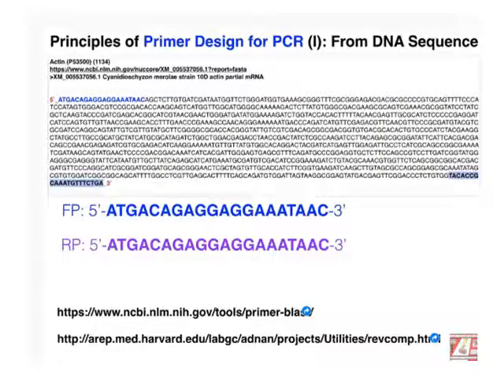Here we are going back to our gene sequence for the actin. What we're going to do is start from the first nucleotide in here and count 20 nucleotides, and we copy it. As I show here, I changed the color of the nucleotides, and I copy it and paste it in here, and I name it the forward primer from 5' to 3'.